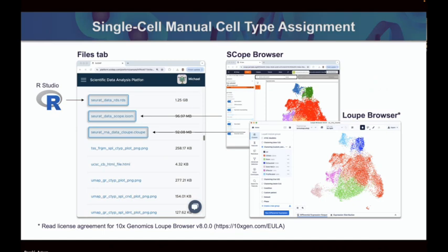Where do you stand on moving to some of the more Python-based workflows that are maturing, but probably still behind? The workflow itself is CWL. Each of the steps can be R or Python or Bash, whatever. And I can give one more detail. The reason we chose R is that the tutorial for Seurat was much better explained than anything similar in Python. Absolutely, that was the obvious choice at that time. Maybe now Python is better.